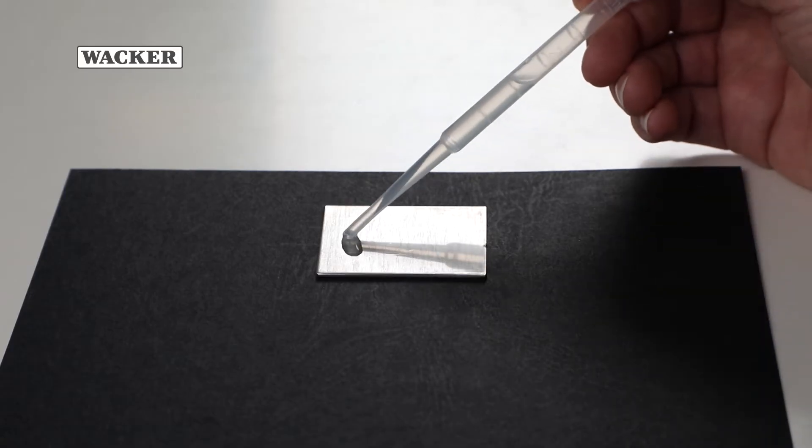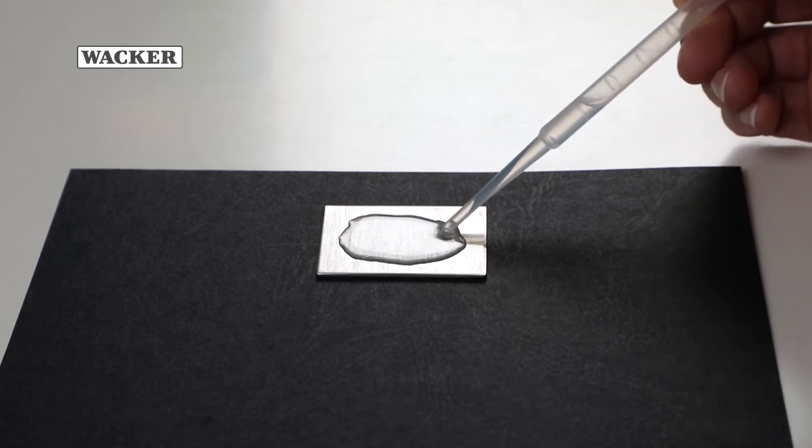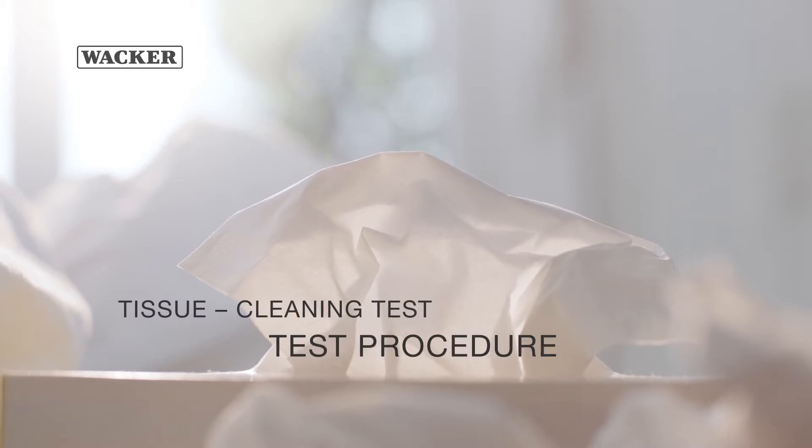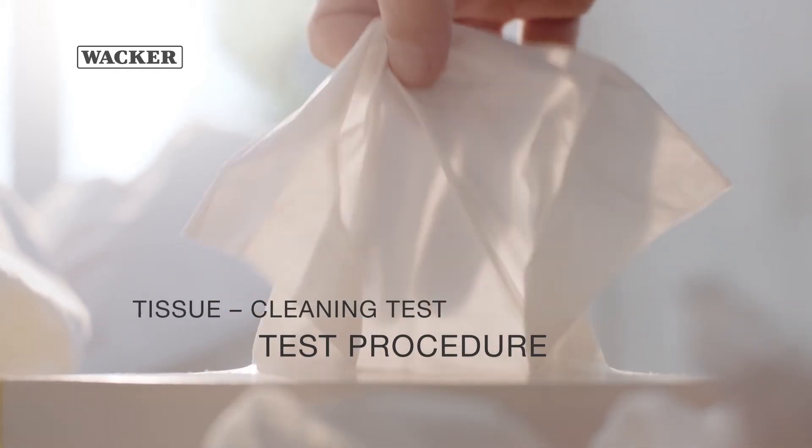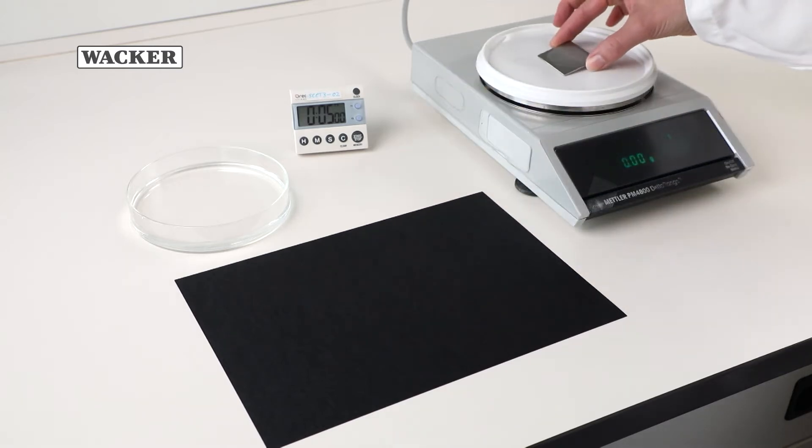Wet a small stainless steel plate with LeoSeal TS lotion and dry to a constant mass at room temperature. Record the weight once the product has dried completely.